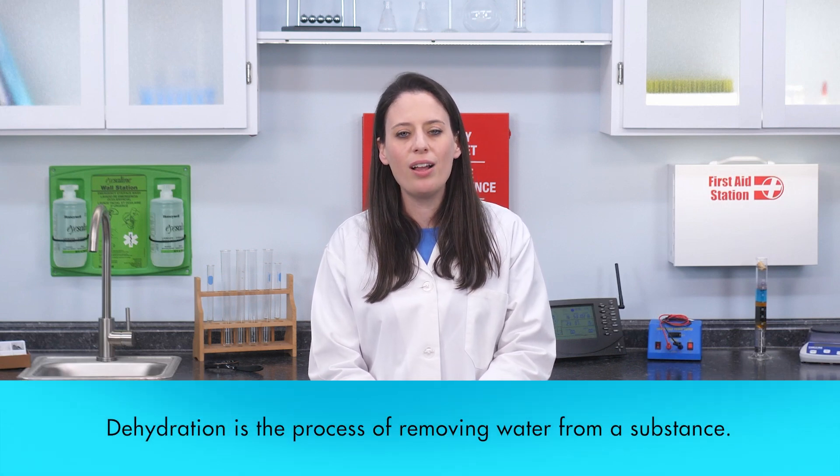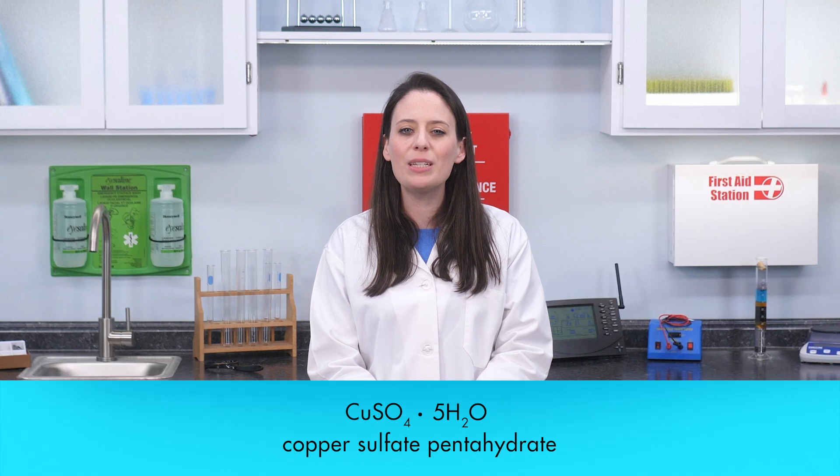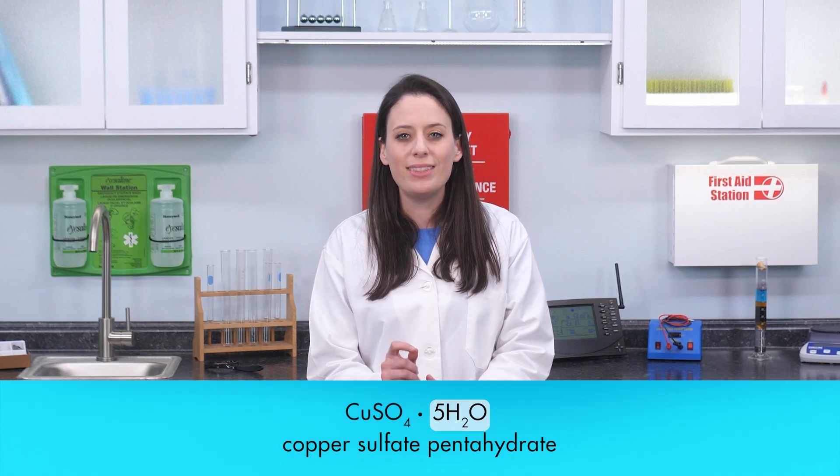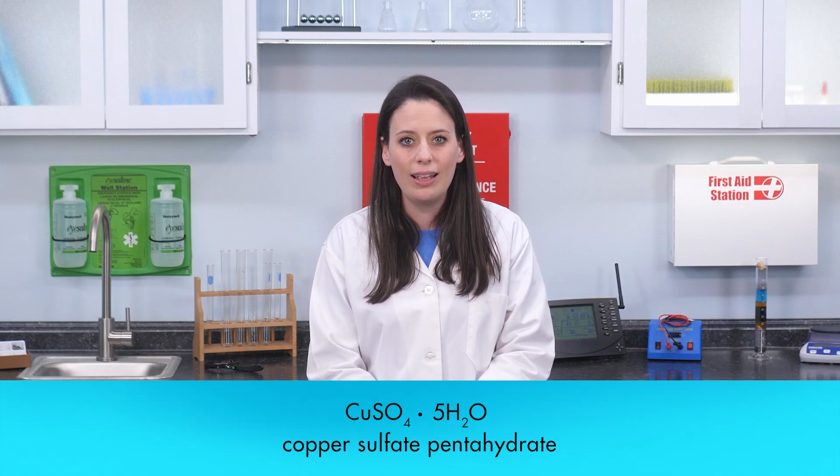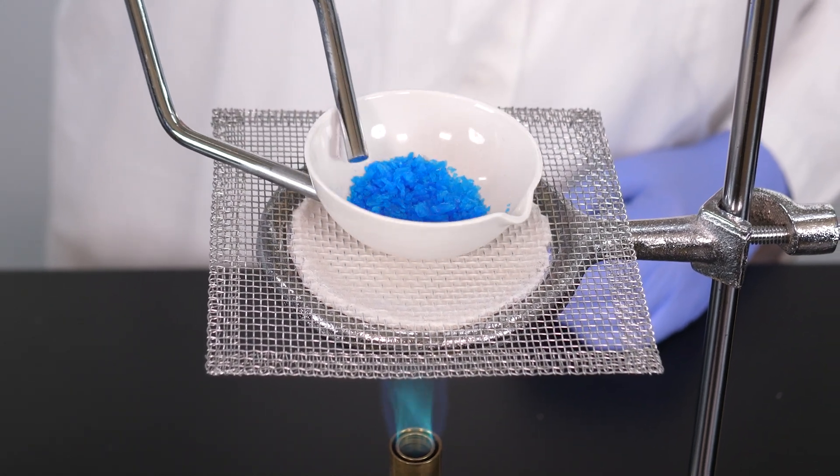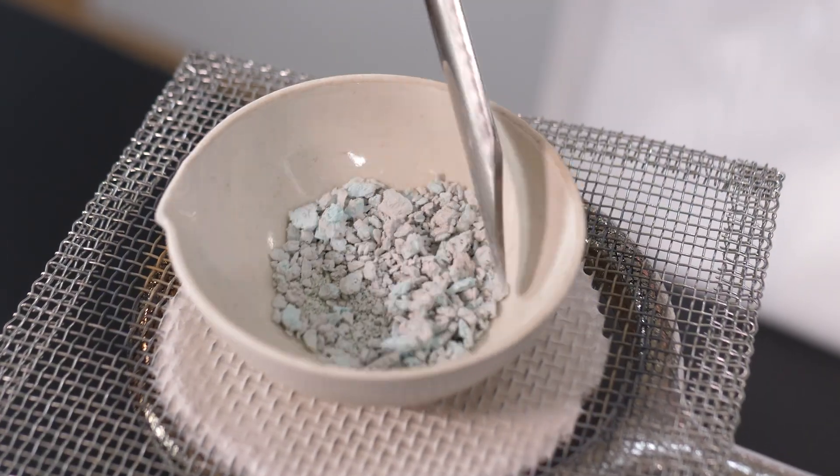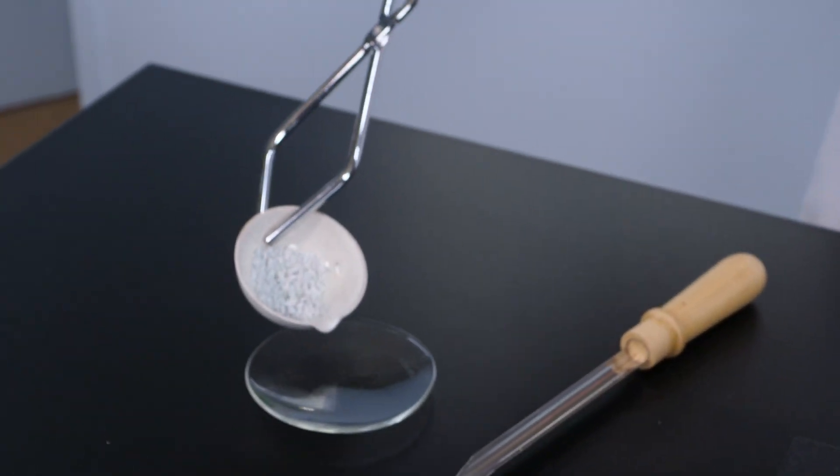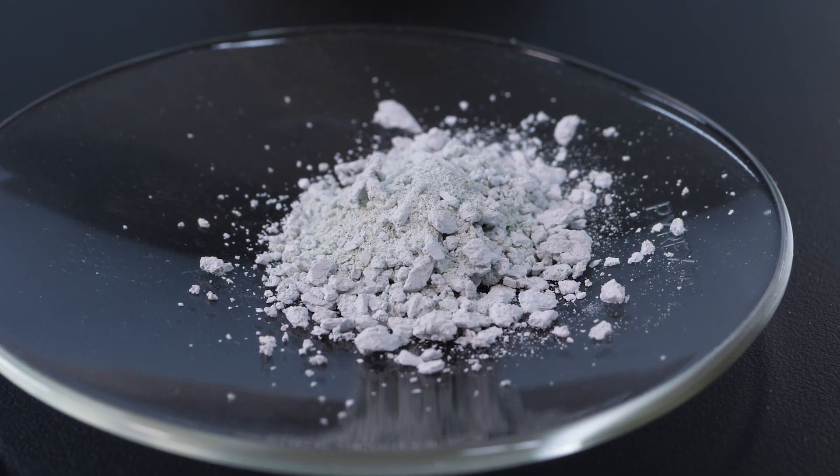We should also conduct a dehydration test. Dehydration is the process of removing water from a substance. In this case, let's look at the chemical formula for copper sulfate pentahydrate. Notice that part of the formula is 5H2O. This means that water molecules are contained in the formula for copper sulfate pentahydrate. By heating copper sulfate pentahydrate crystals in an evaporating dish, we can cause the water to evaporate. As the water evaporates, the crystals will turn white. When all the water has evaporated, only a residue of white, crystalline substance remains. This is consistent with anhydrous copper sulfate.